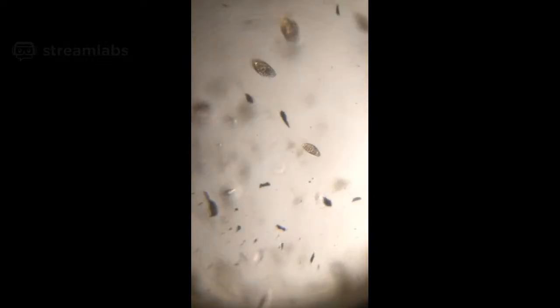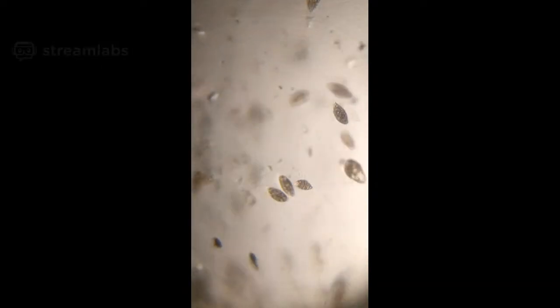There you go. You see that big guy there? You see this guy there? Okay, see this. Let's get it. Oh, you see that one? Yeah. No, that one with the big open mouth that we're chasing? That's a cannibal. Wow, you know what a cannibal is? Well, an organism that eats another one of the same type. And you know how this survives? This is an extraordinary, remarkable thing. I wish I had learned this in school. I would have become a tetrahymena biologist.